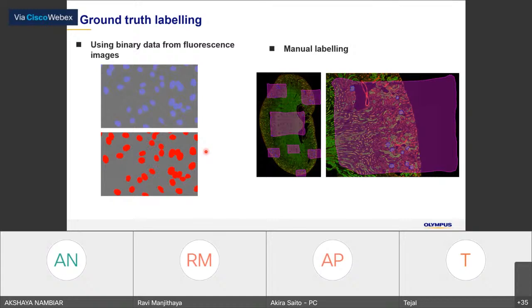So the ground truth labeling can be done in both ways. You can use another observation method, or you can do it by manual labeling.